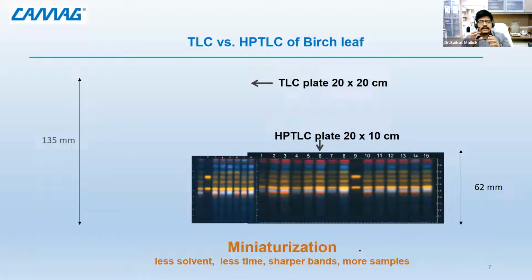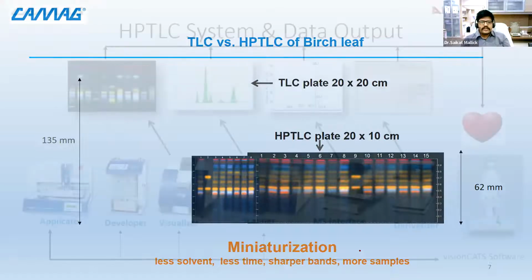So these are some of the important aspects when we are converting to HPTLC. The size reduction, the sample application, the development, everything I have shown here is one part. But actually HPTLC is not just this. It is a practice by which you get very reliable, very firm results without any variation, and the same results each and every time. So let us go further and see what it is all about.